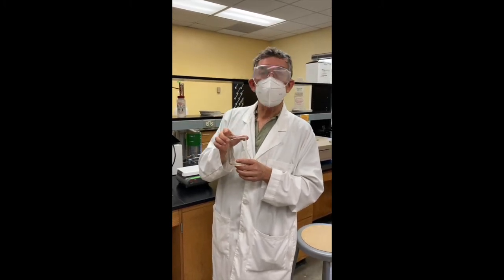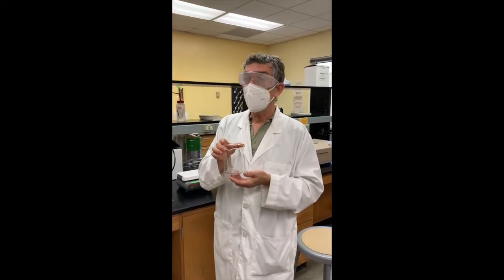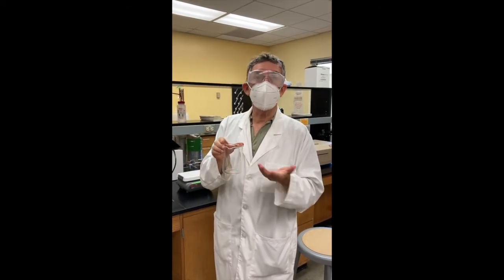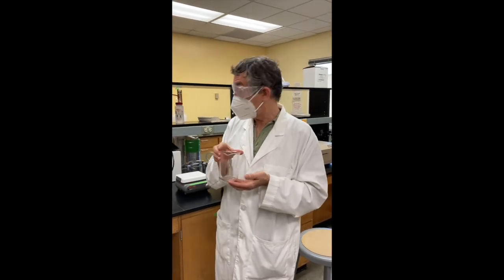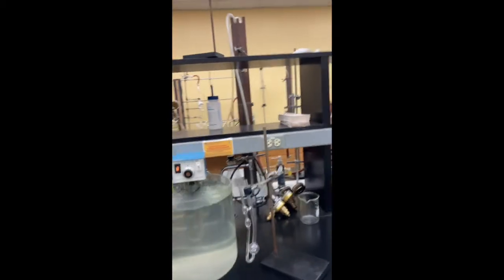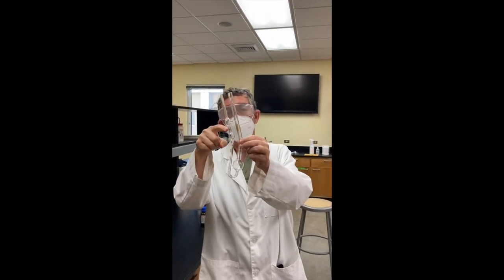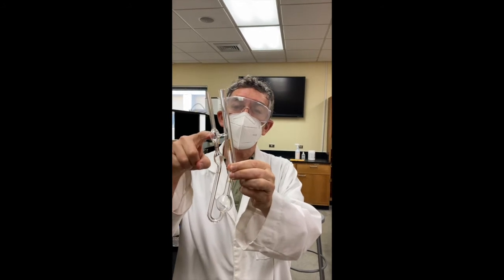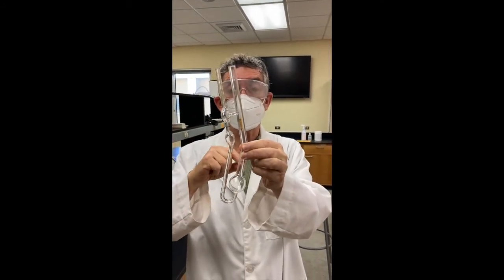There is a downside if you have to do that, and that is that you can leave some of your polymer on the glass wool. You can do some rinsing, but you will lose a little bit that way, and that will give you uncertainty in the mass ultimately. But it's better to do that than leave the particles, and the reason is, I might as well show this at this point, you will ultimately be allowing your solution to pass through a very small bore. And this will be talked about shortly, and it's the length of time it takes the solution to pass through that bore that will determine the viscosity.